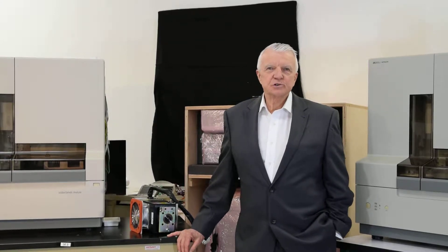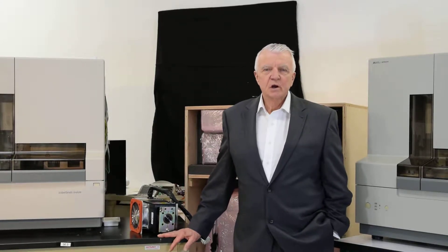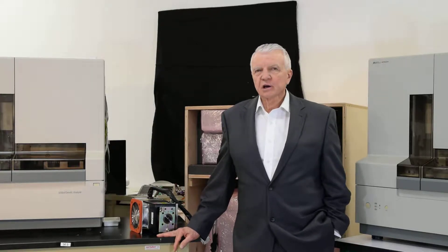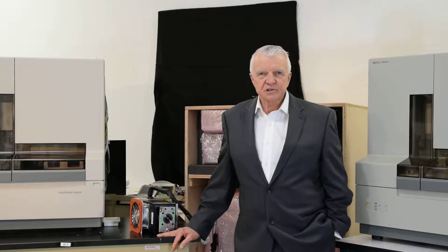Hello, my name is Bruce Erickson with Certified Scientific Instruments. We've been selling DNA sequencers since 2001, and I wanted to talk to you today about how to buy a DNA sequencer.